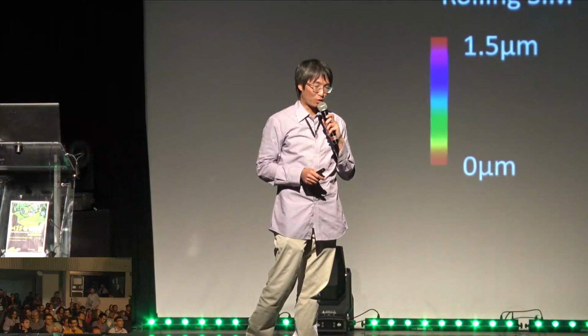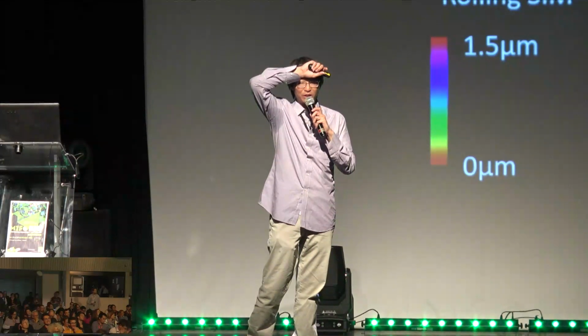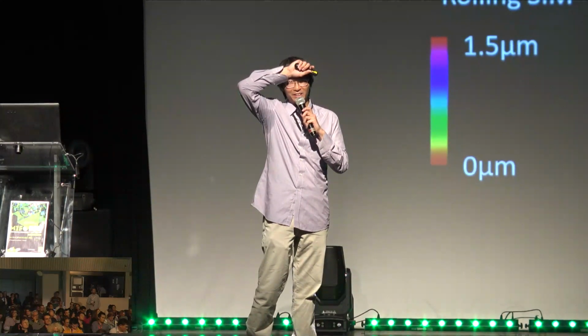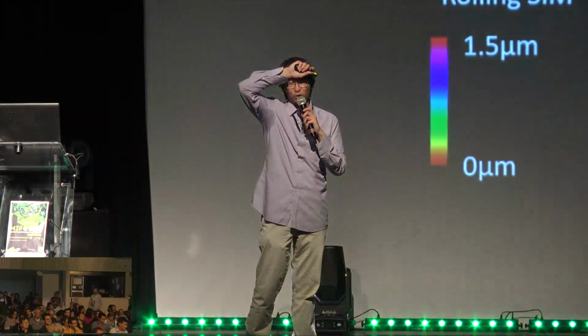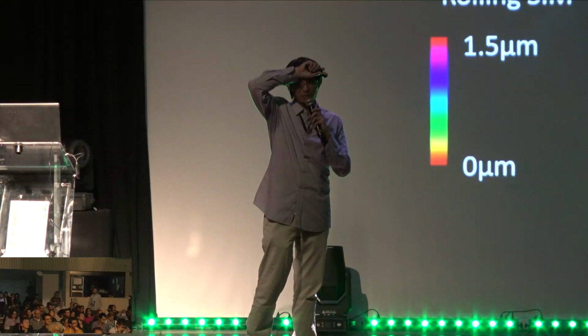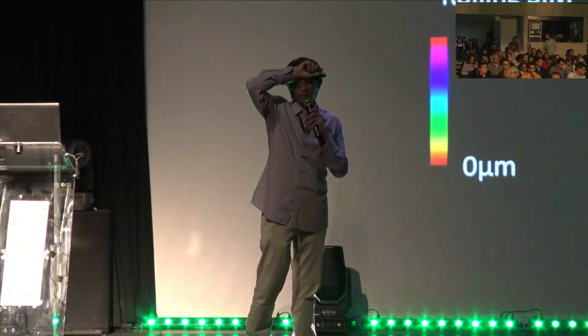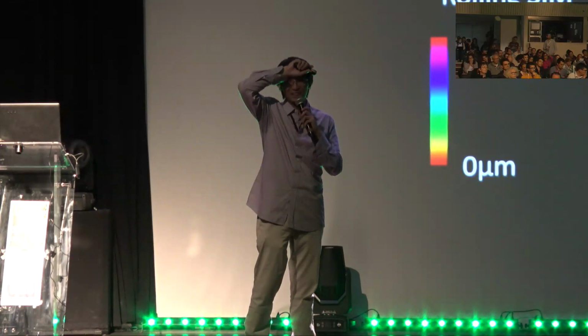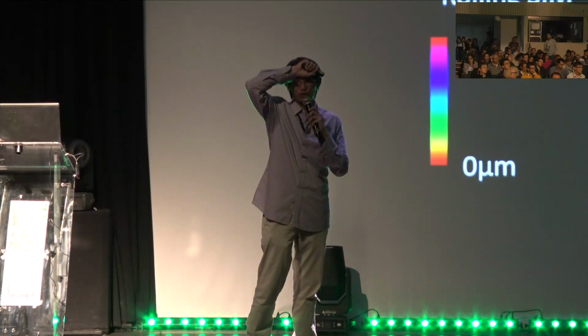So one of our colleagues in the lab, he is a biologist, and we have many different light sheet setups in our lab. And he seldom uses them because they're just too difficult to use. Well, it's not that difficult. I feel it's quite useful for me, but for him, it's a little bit difficult. And then one day we built this OPM system, and he started to use it. And you can see how user-friendly that OPM system is. And it's also quite stable for the OPM. But for the OPM SIM, it's not that stable because a little drift of one optic would destroy your whole pattern or your whole reconstruction. So for that, it's more tricky.